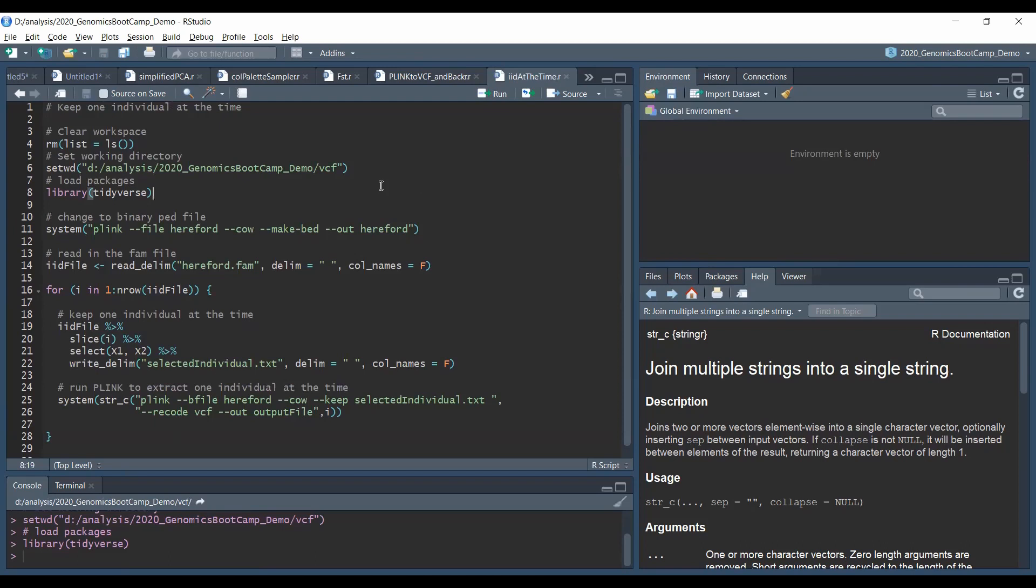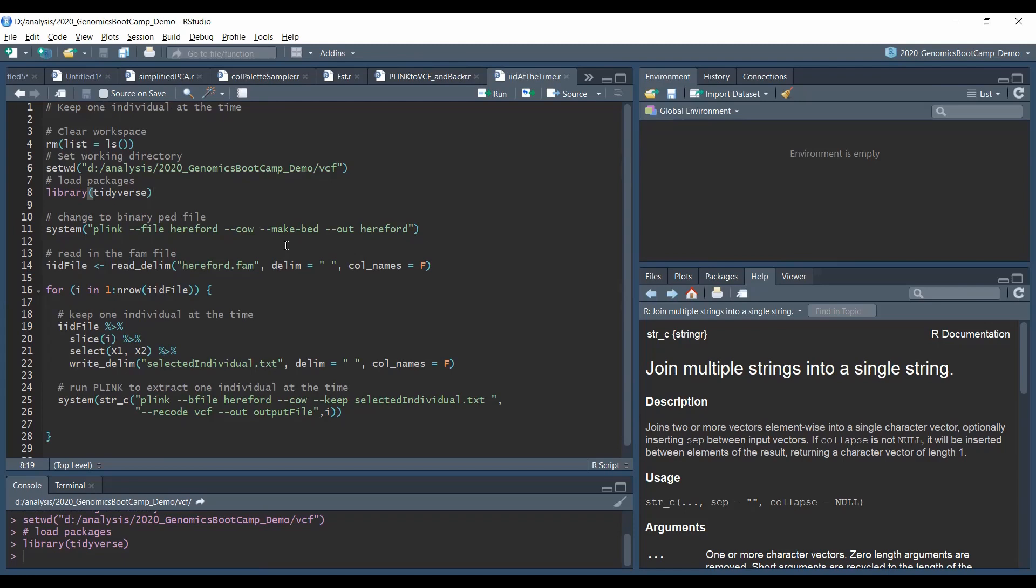Out of convenience we work with the tidyverse, so we need to load the dplyr library, and we actually need the binary ped file. So if you don't have your Plink files in the binary format, then you could run this line. Otherwise if you have it already in binary format this is not necessary. Now what we really need the binary ped format for is that this file, the fam file, which actually lists each individual in one line. And this is really useful for us because you can have hundreds and thousands and tens of thousands of individuals in your data files.